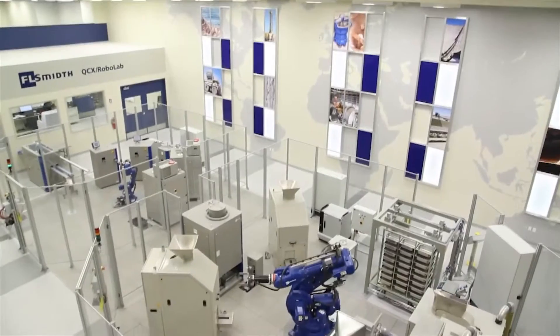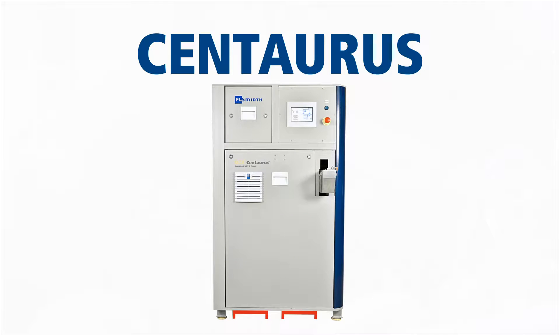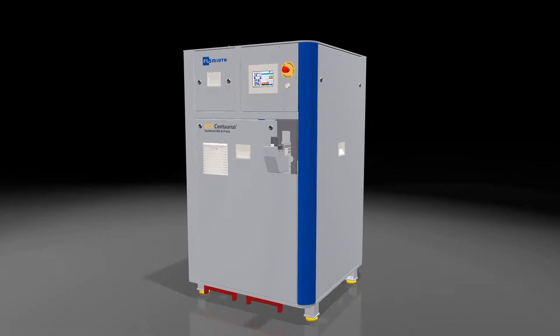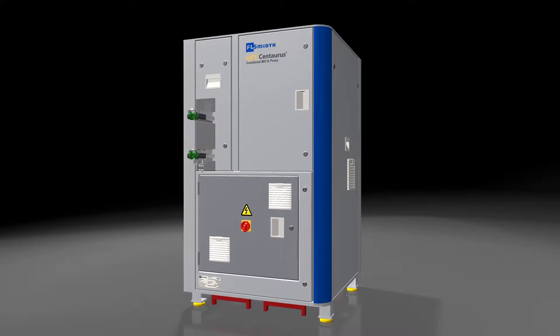For over 35 years, FLSmidth has delivered comprehensive cutting-edge laboratory solutions. FLSmidth introduced the Centaurus V2 combined mill and press for X-ray sample preparation. The Centaurus V2 incorporates advanced mill and pressing technologies and a compact design to minimize valuable floor space consumption.